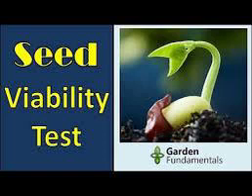Disadvantages: relating staining patterns and their interpretation in terms of viability is difficult and requires considerable experience. Distinction between normal and abnormal seedlings is difficult. The total work included in the test requires a greater number of man hours than germination test. This test alone is unable to differentiate dormant and non-dormant seed. Microorganisms harmful for seedling emergence remain undetected. Correct evaluation is possible only after prolonged experience.